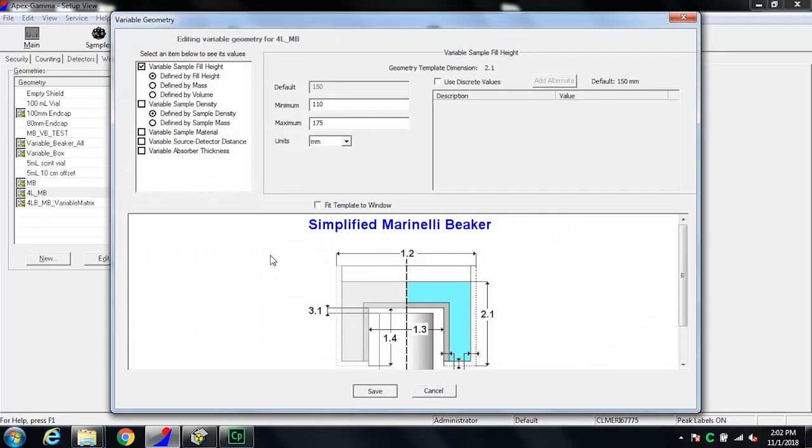I have many other options that I can come back to on the screen, but once this geometry is used to create a new efficiency calibration and is approved, I can use this calibration in a procedure like any other. This is what the operator sees.